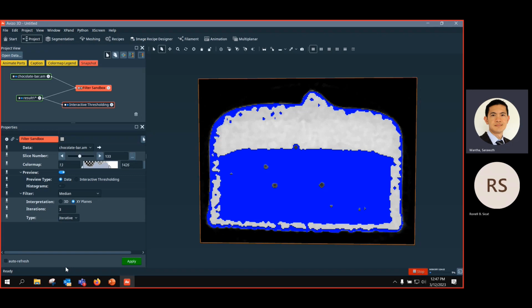Because usually when you have the grayscale, it shows you instantly how the pixel intensity is in the unit for the image. It is 16-bit for the intensity range, or if you have 8 bit, it comes to a different range.